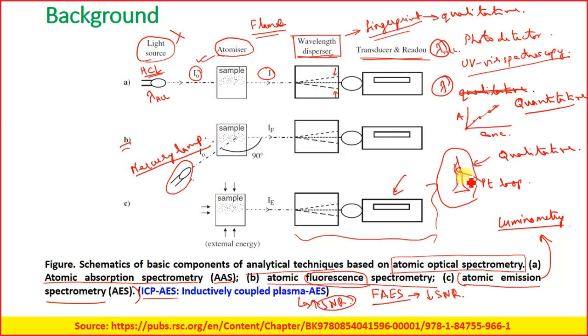You take a Bunsen burner, you take the platinum loop, you follow the same procedure, and then you use a homemade spectrometer there. There are many resources available on the internet, and you will find it's very easy to develop these spectrometers. In a dark room, you just take the readings, and you will be able to get the information.